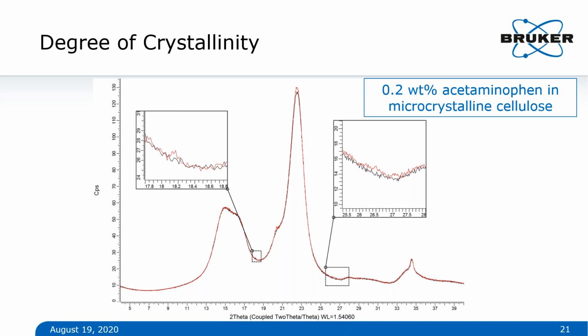If low crystalline signal is there, does increasing scan time help in increasing the signal? I probably need to rephrase that question. So increasing the scan time will increase the statistical averaging of your sample.